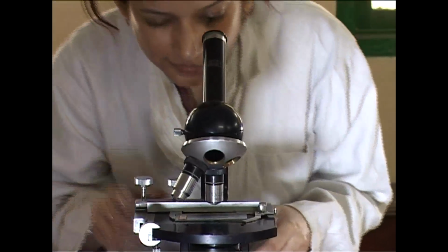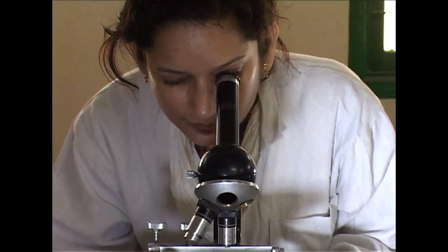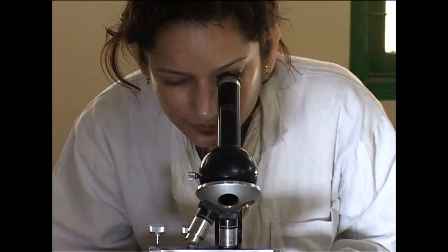If the organism is gram-positive in nature, then it will retain the primary stain, that is crystal violet iodine complex, and hence it will appear purple in color. If the organism is gram-negative, since it contains a large amount of lipids in the cell wall, the crystal violet iodine complex will be lost from the cell wall and it will be counterstained by safranin. Hence, the organism will appear red under the microscope.